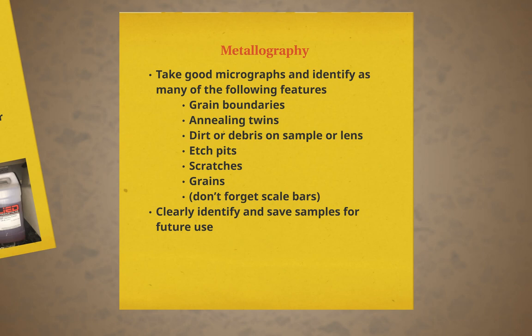After all the preparation and cleaning of the sample, the final sample is observed under an optical microscope. The key features we are looking for as we observe the brass are grain boundaries, annealing twins, dirt or debris on the sample or lens, etch pits, scratches, and grains. It is important to keep the magnification in mind.